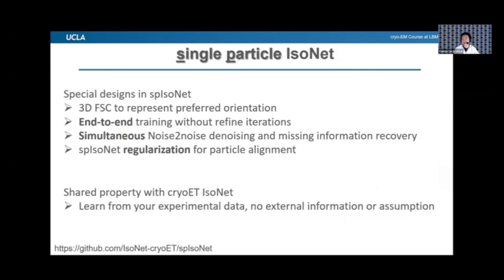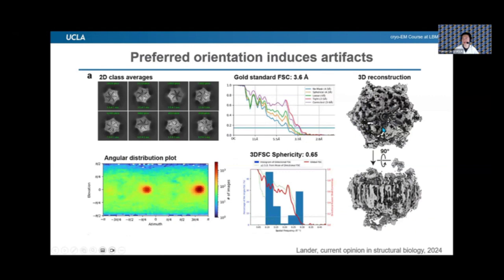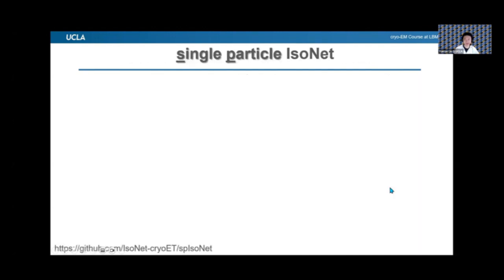From here you can either use a reference map or not use it. This can work either with reference or without reference. This is also fine.